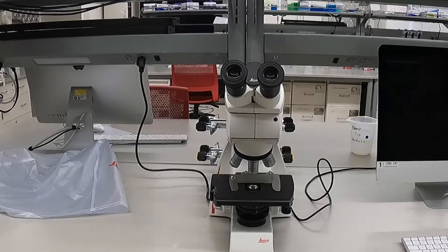The first step towards being able to comfortably and confidently use a microscope is to know what the different parts of the scope are and what each part does.